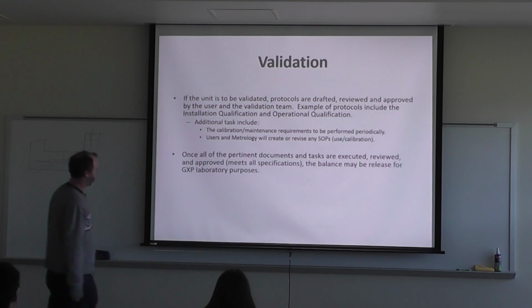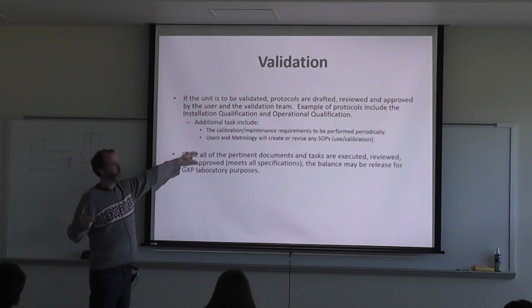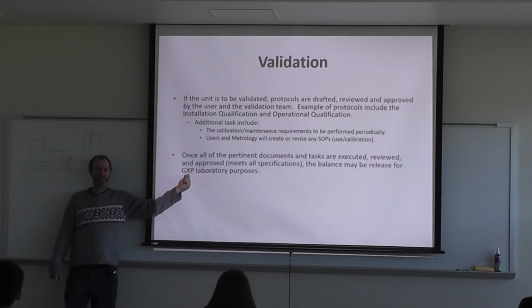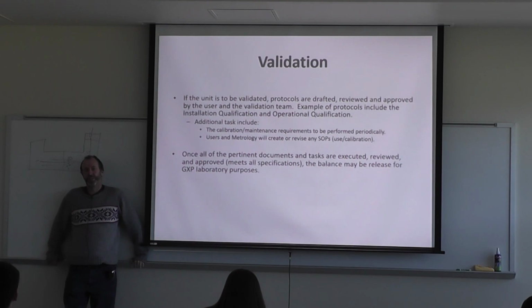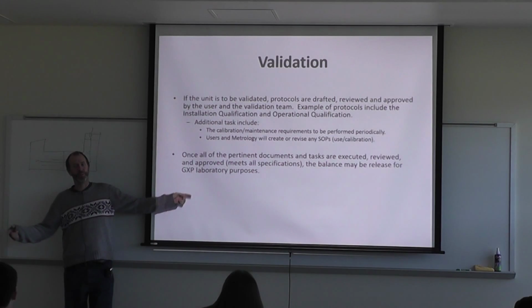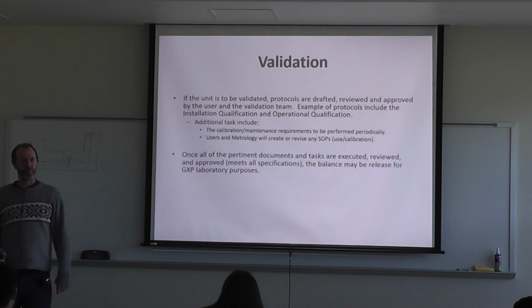Basically, anything you have to do, the balances have to be validated when you're in a GXP laboratory. What is GXP, do you guys know? Don't know? What is GLP? Or GMP? GXP stands for GLP, GMP, and GCP, all at the same time. You should know, you work in one.